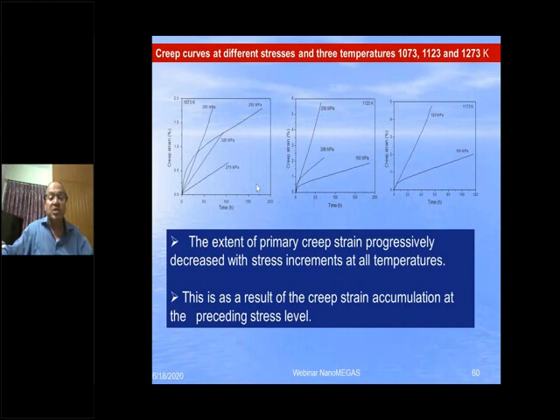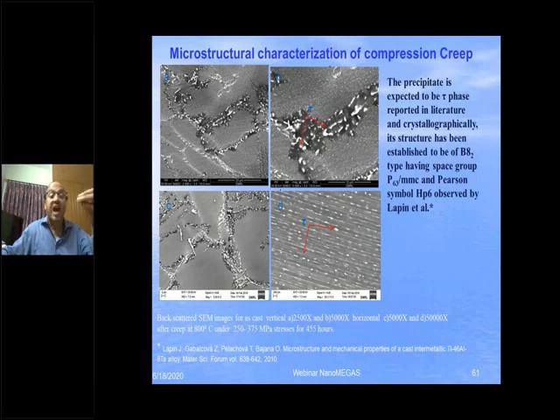So the creep value, which is very important for aero components, cannot be understood by doing a simple EBSD and EDS structures. To understand the creep value, I think you know that creep is a time dependent deformation. That means if you keep on using it, what will happen with time is very important for the aero component.